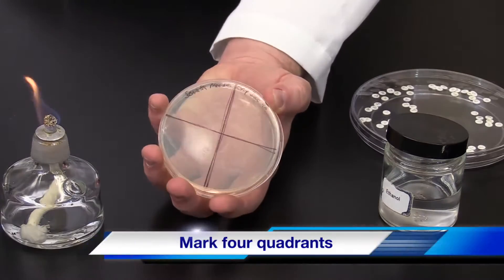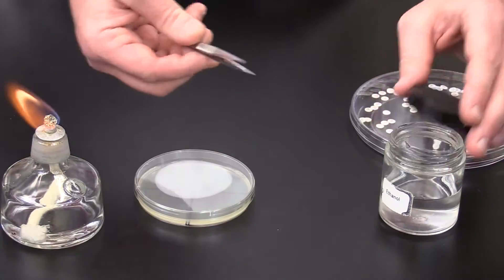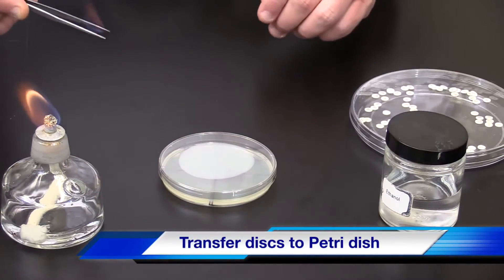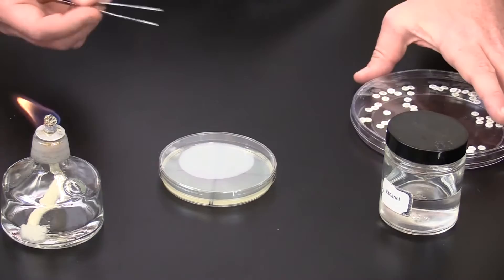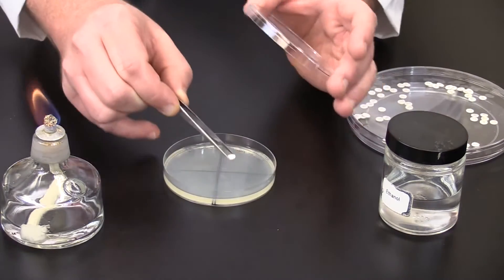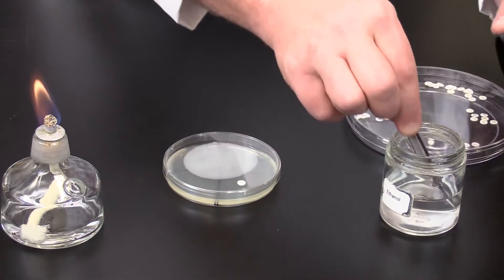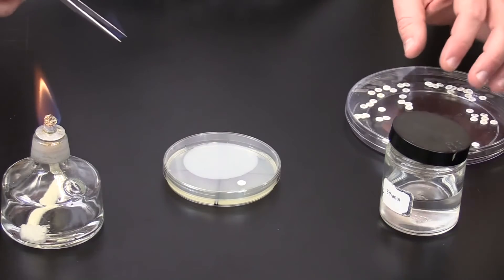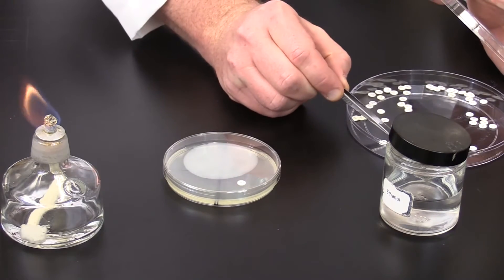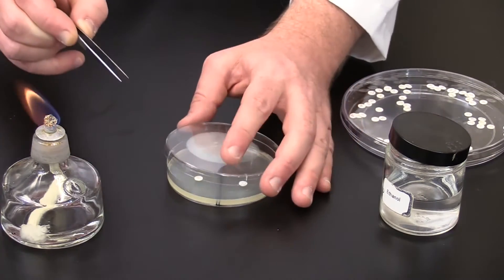With a marker, divide the plate into four quadrants. Flame sterilize the forceps and make certain the ethanol has burned off completely and allow it to briefly cool. Pick up a disc carefully and place within one quadrant and tap lightly. Flame sterilize the forceps between placing discs. Again, remove the lid, place the disc, and gently tap.